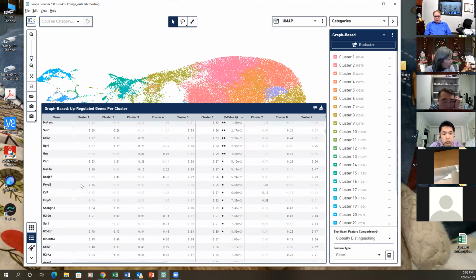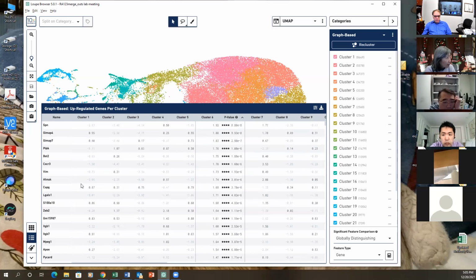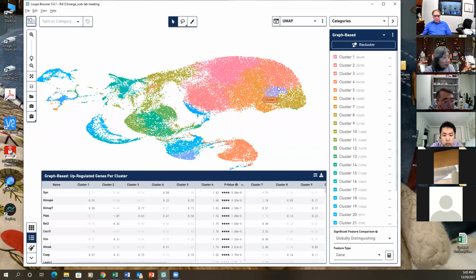Well, when I compare, I found that there's one that came up in the double negative too. This one? I mean, comparing knockout and wild type. Yeah, there was one interferon related gene that came up. Right, but here you say this is the type 1 interferon regulated pathway.